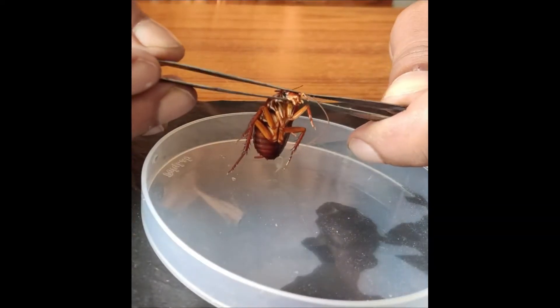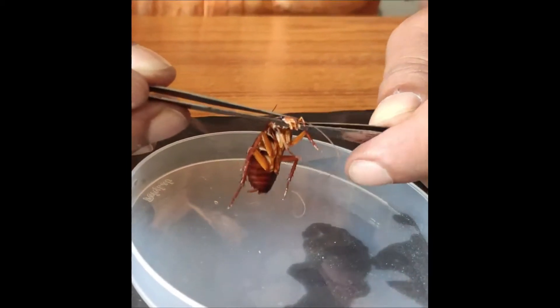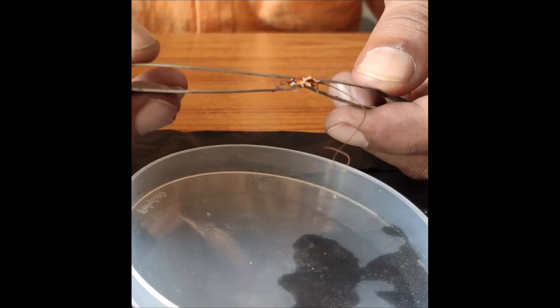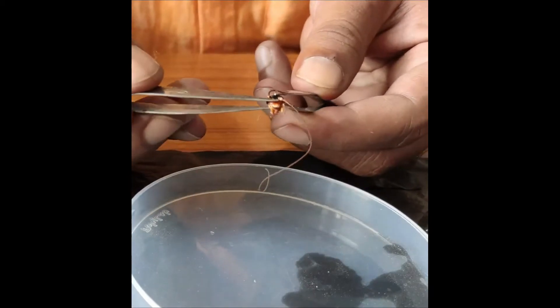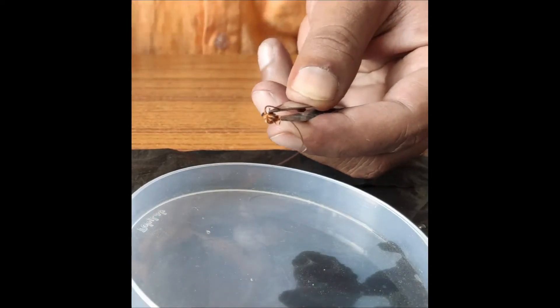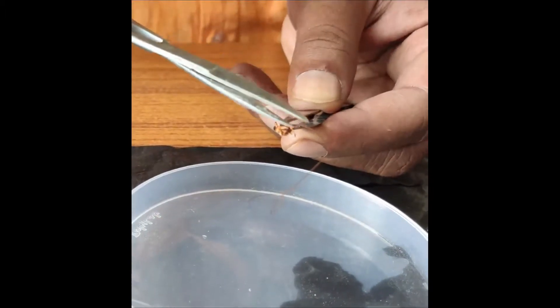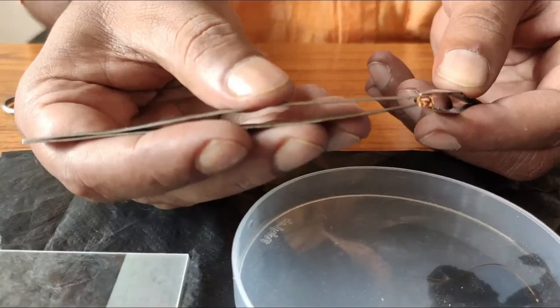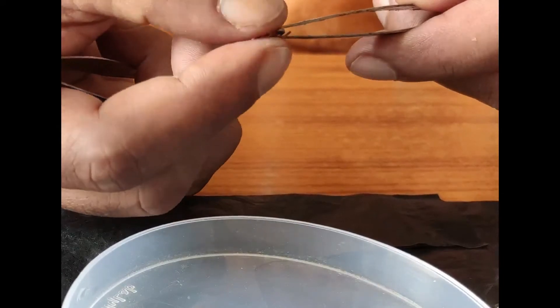This is a cockroach and we have to dissect the different appendages of its mouthparts. I'm holding the insect head at its tip with the help of forceps. Now removing the antennae. My style of dissection involves going to the back of the insect head by inverting it.